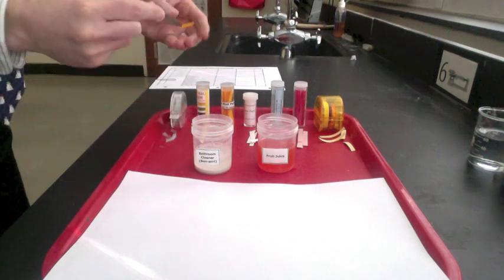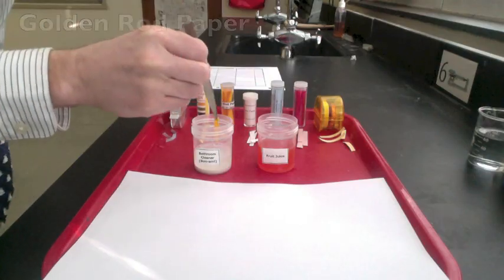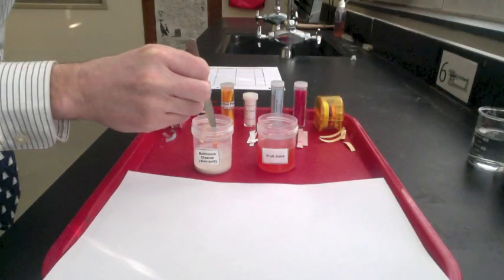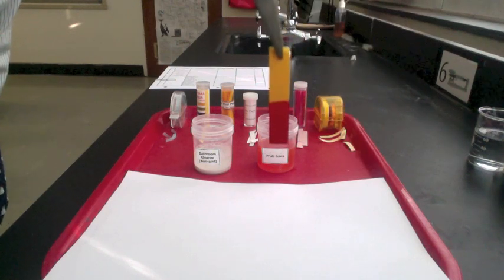First, we'll test the bathroom cleaner using goldenrod paper. Goldenrod paper turns gold to red for bases. You can see the goldenrod paper turn to bright red. That means the bathroom cleaner is a base.